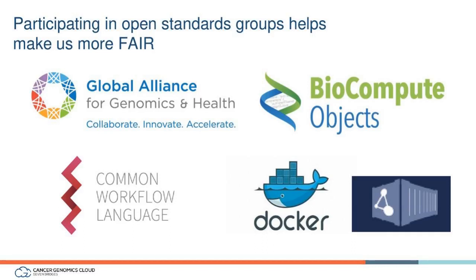We're also pioneers in developing the Common Workflow Language, which makes it very easy for stitching together several pipelines and dedicated workflows for your research analysis. We actively deposit our tools in the Dockstore, so it's accessible by everybody. And also, we are actively involved in the BioCompute Object implementation, which is an IEEE standard designed for communication of next-gen sequencing data, and it's supported by the FDA for regulatory submissions.